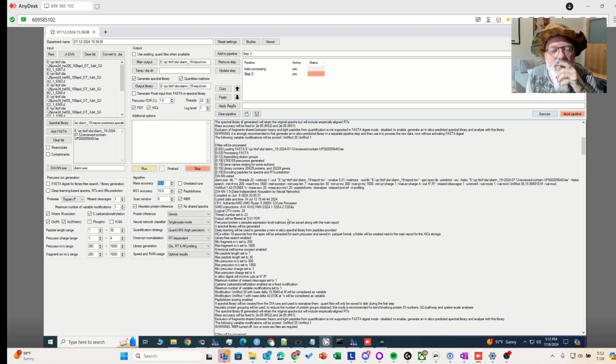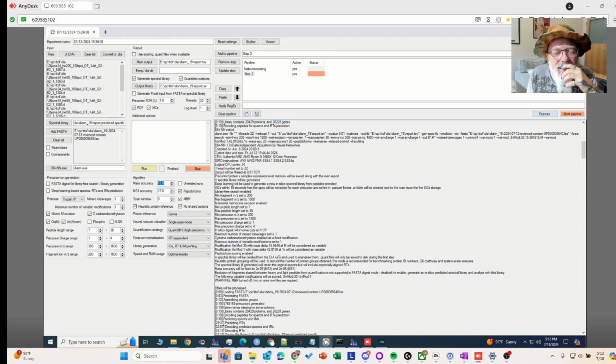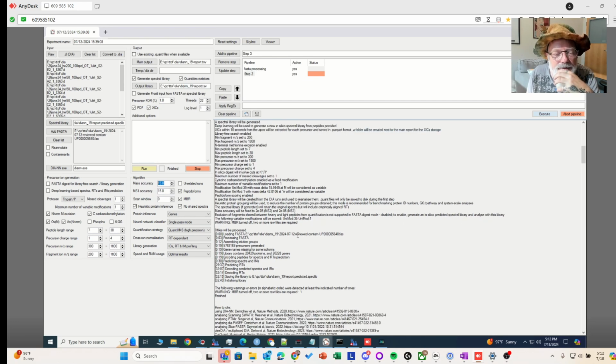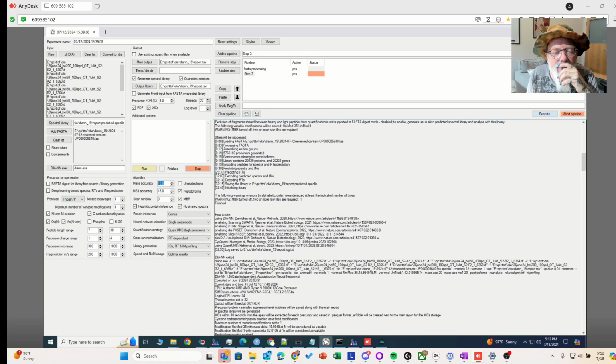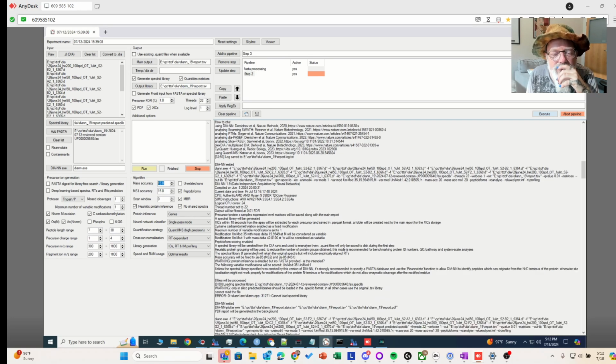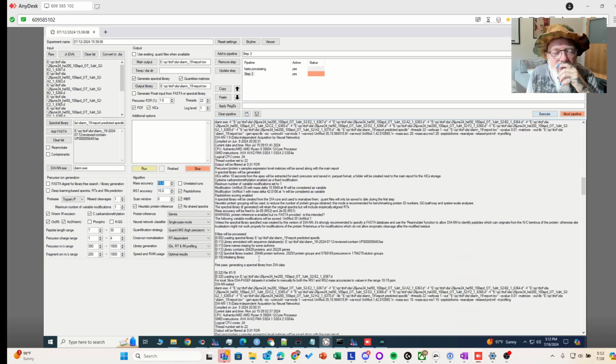It'll tell you somewhere in this text what you should do, and then usually I go, oh, and then I forget, and I hit stop, and then I change it, and then I start again. Let's see, usually it'll tell you somewhere here. See, I did it here again. Anyway, it'll tell it somewhere.